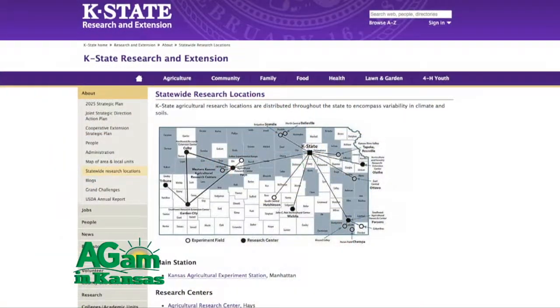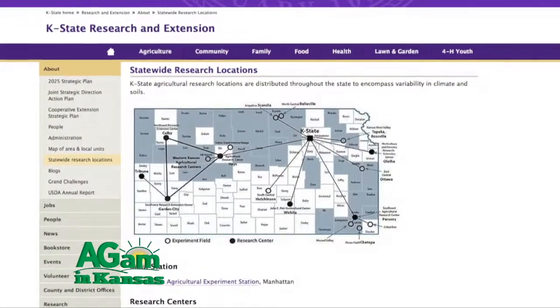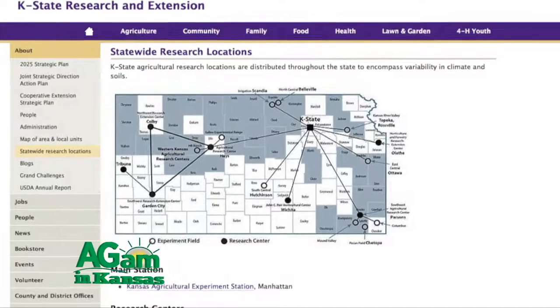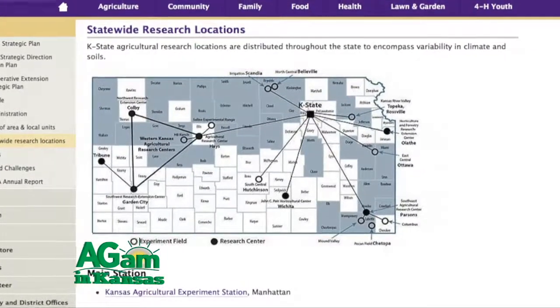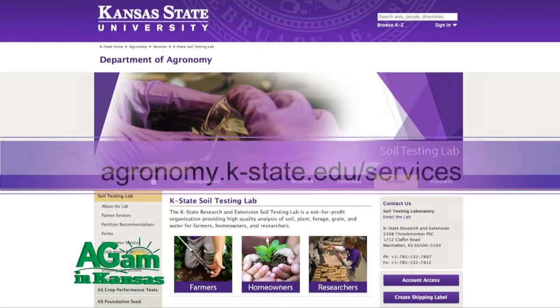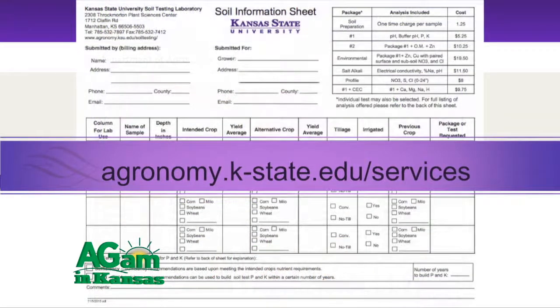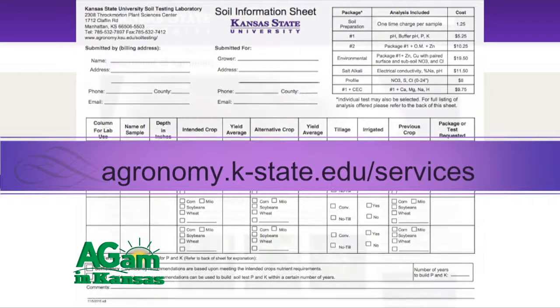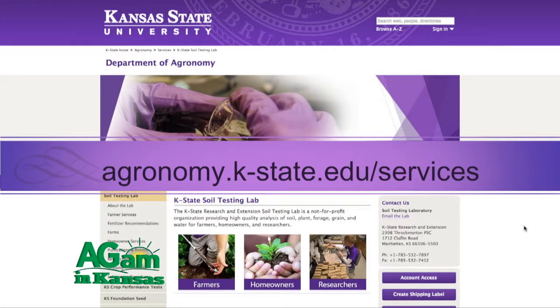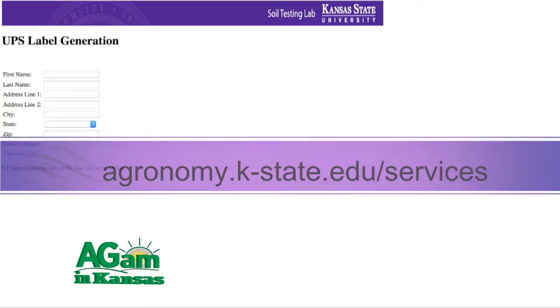One of them that is very common is through the county agent, the extension office. Basically, the producer can work with the county agent and the extension office at the county level, and they can send the samples to us. Another approach is also for the producer to send the samples directly to us. Actually, in our website, we give information for shipping instructions, as well as provide shipping labels that you can print at home, put it to the box, and that will get to us pretty much overnight.